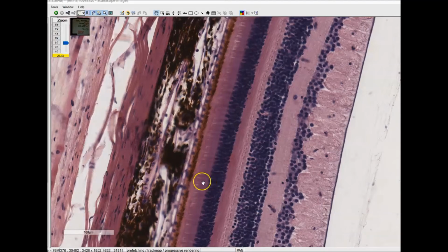They have what we call the inner segment, which is the nucleus and most of their cytoplasm, and then the cytoplasm of those Mueller cells ends right here at that outer limiting membrane. So all of this stuff is covered or kind of encased in Mueller cell cytoplasm. However, that ends, and all of these outer segments of the photoreceptors are not covered by the Mueller cell cytoplasm. As a matter of fact, they interface towards their tips here with the retinal pigment epithelium.